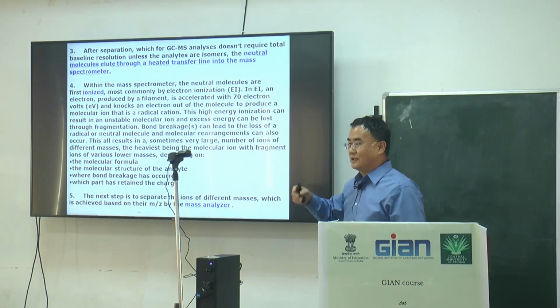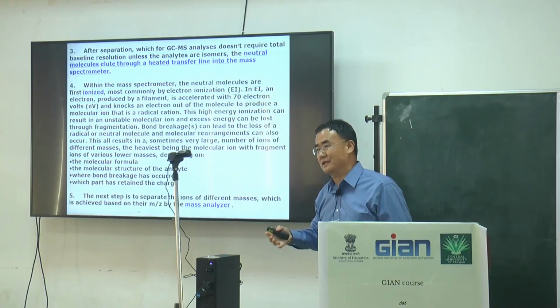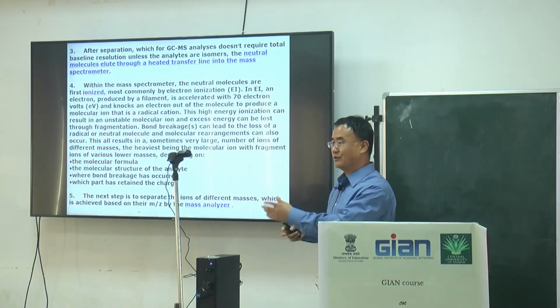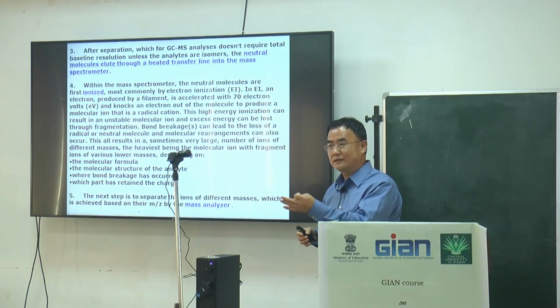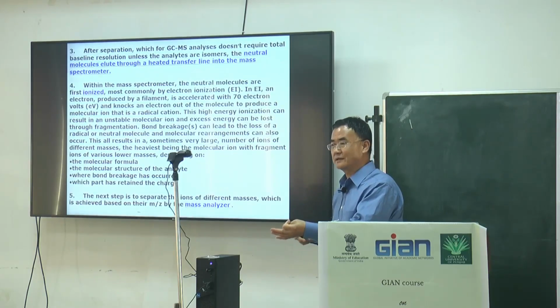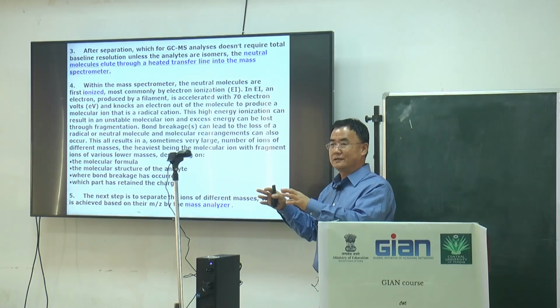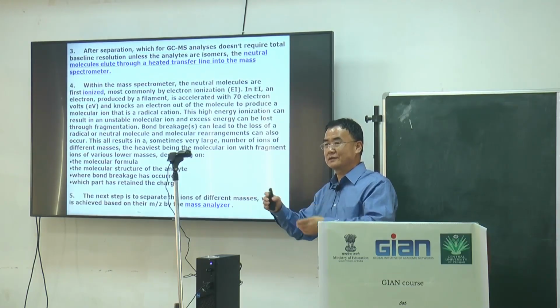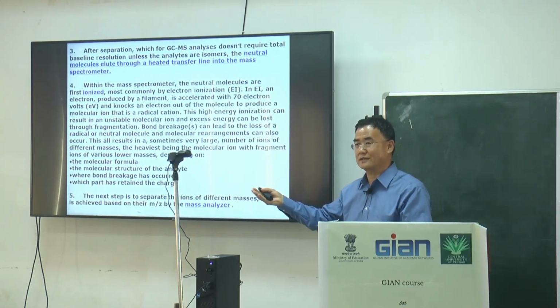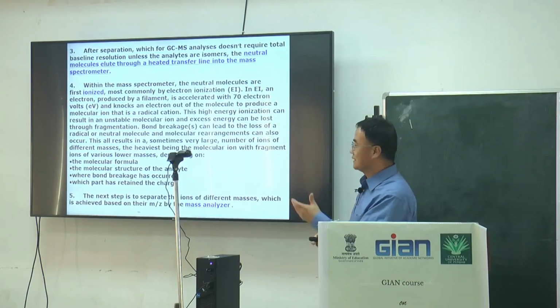This is not fully complete; it depends only on the machine unit. For example, with regular HPLC and a proper protocol, we can easily separate EGCG, the major catechin in tea plants, in tea leaves. We can separate EGCG and GCG. EGCG and GCG are isomers, with the same molecular weight but a different arrangement of the chemical groups. One is inside, another is outside.